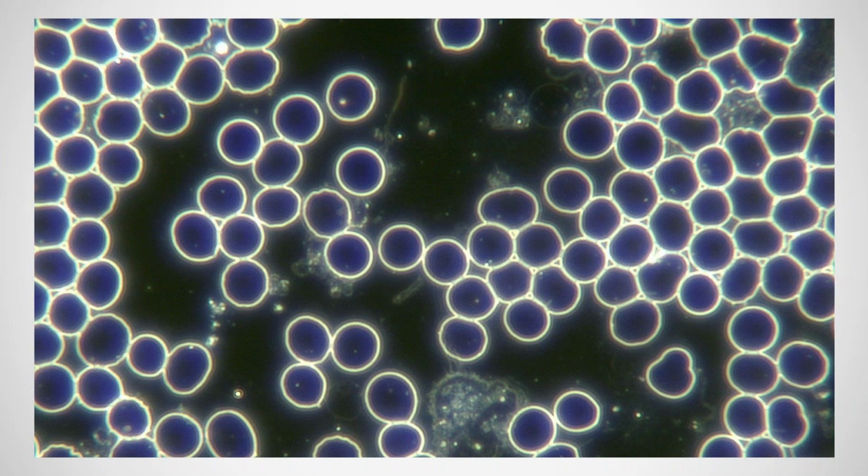So you wouldn't be able to see any of these anomalies in just bright field? No, well, bright field will show you the ghost cells, but your pleomorphic anomalies and being able to see clearly what's going on with white blood cells, fibrin, and many of the other anomalies that we actually encounter in the plasma are not visible in bright field.